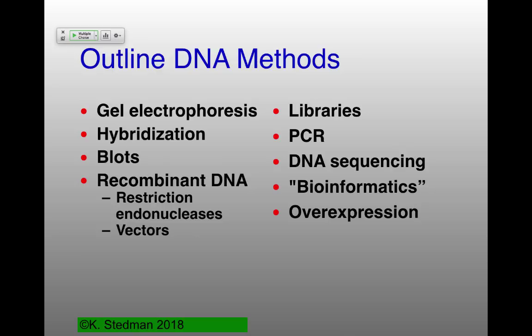What we are going to talk about today is gel electrophoresis, but now not protein gel electrophoresis, but nucleic acid gel electrophoresis. A little bit more about hybridization. Again, it's getting those two strands to come together. And very important about hybridization is not so much getting those two strands to come together, but to be able to detect one of those two strands, and usually the short piece.